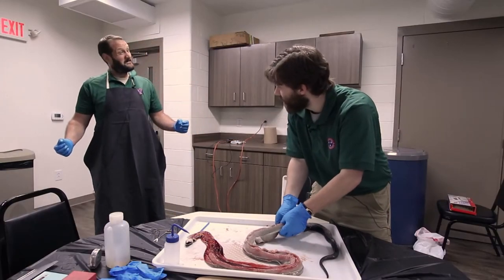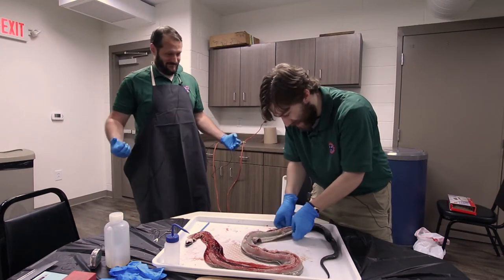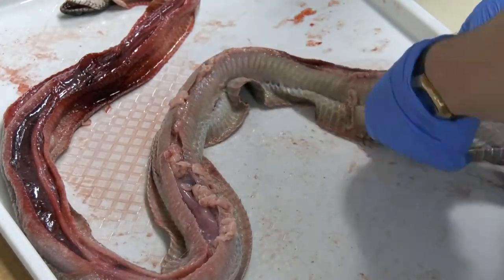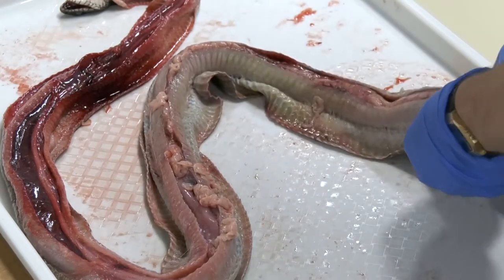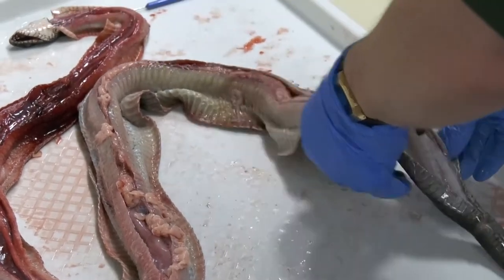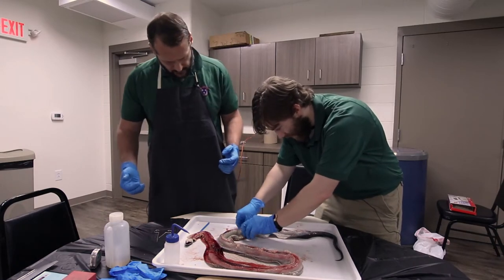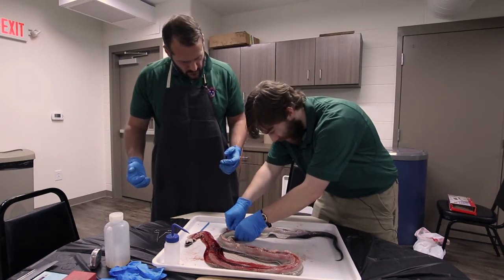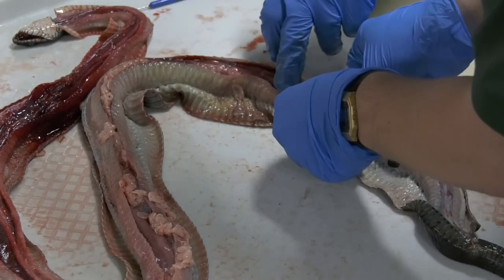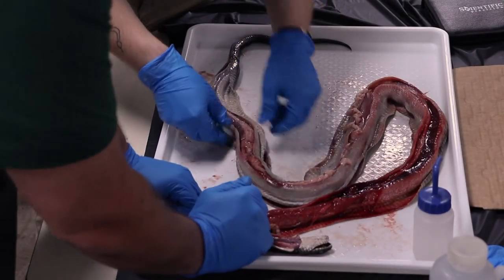We're getting into some of the grosser stuff. Yeah, I'm detecting that. All right, let's see what we've got here. Some intestines. So these would probably be mostly small intestines, I'm gathering. They don't look all that different from yours and mine.